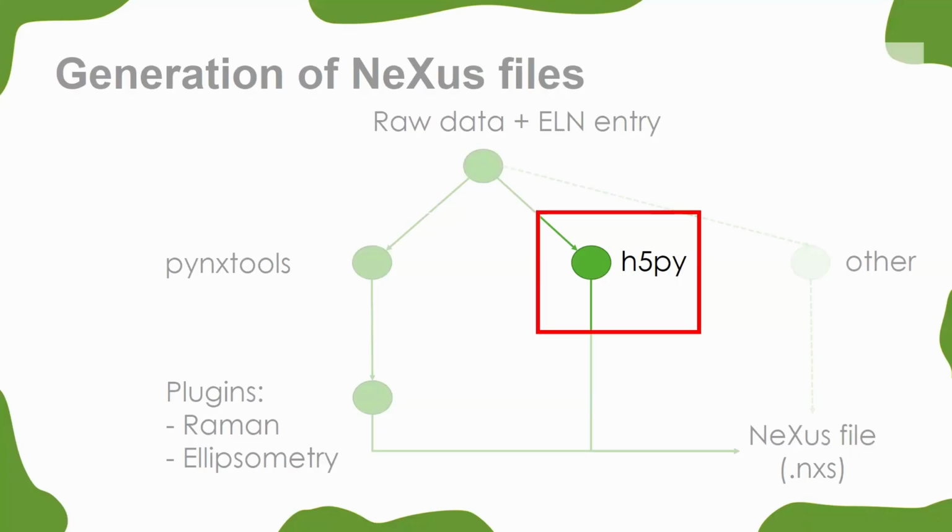All right. So now I have shown you how pynxtools and the plugins work. And now I can come to a part where I show you how you can use h5py to do this. This is a Python package, and the advantage is that you can integrate it in your setup as you want. There's also the disadvantage that you do not have the one-click possibility, where you execute just one command and everything is converted. But at this point, you can include it in the setup as you like.